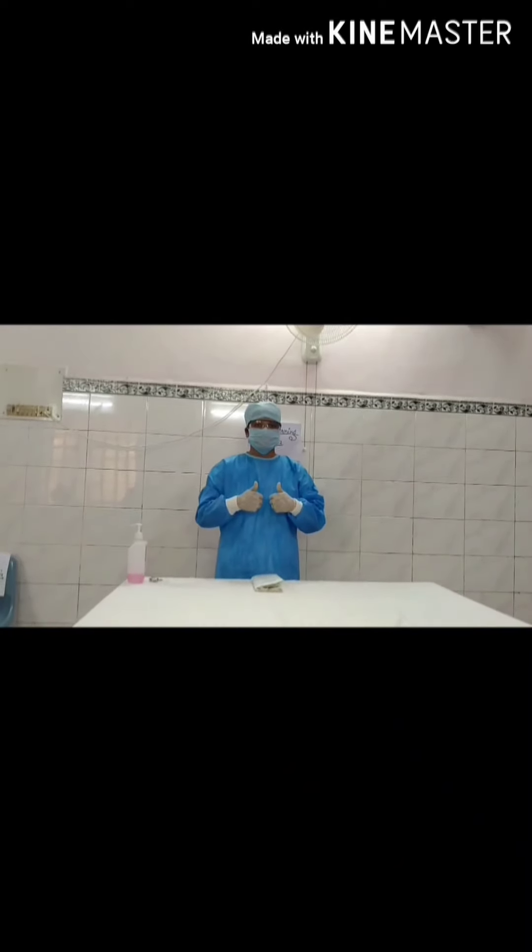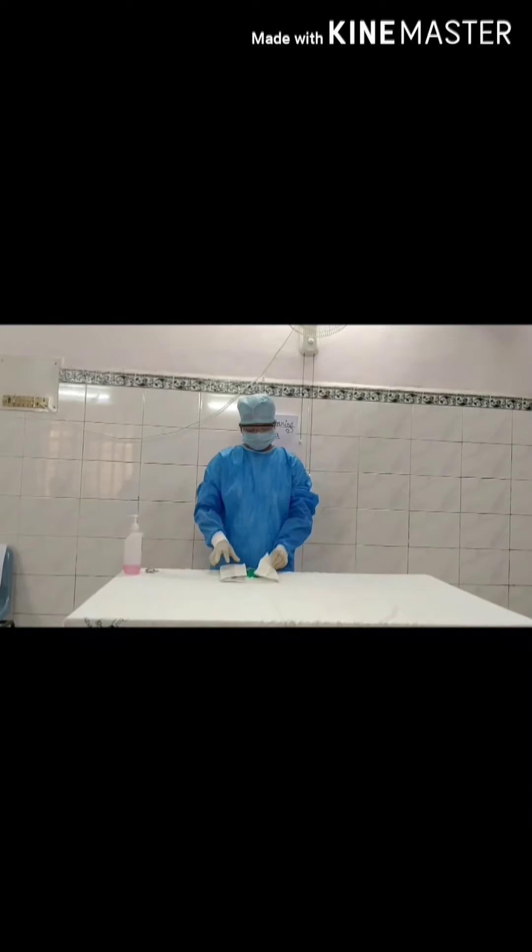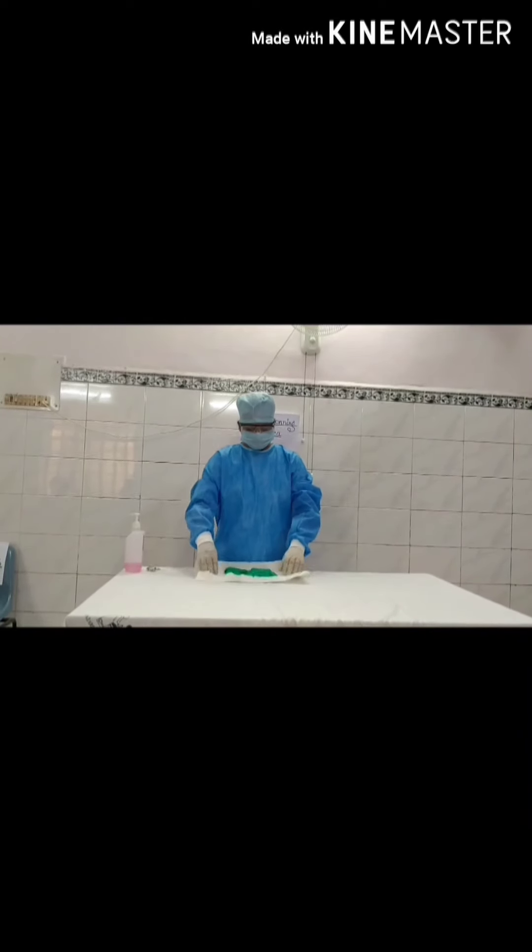Wear the second pair of surgical gloves, making sure to cover the wrist part of the gown.